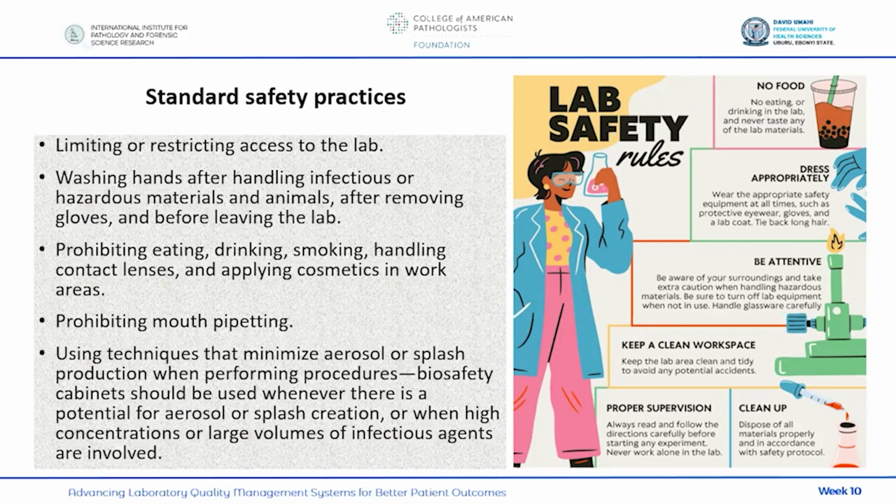For people who work in the laboratories, all these modern styles of hair, especially for the ladies, that are made to be so long and are dropping, they are not good for you. It is against the safety practices in the laboratory. So if you have that, yes, you can do it, but where you're coming to work, it is appropriate that you tie it back. You pack the hair back so that it is not touching the lab bench, is not touching anywhere and getting contaminated. Better if you don't have that long hair, but if you have it, you need to pack it up and tie it so that it doesn't have contact with any other thing.